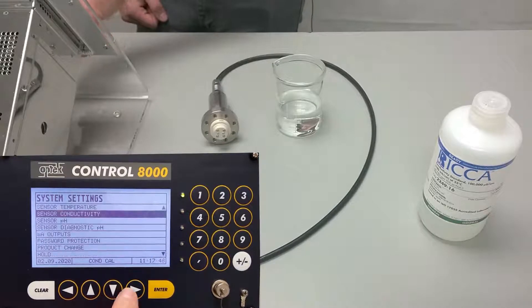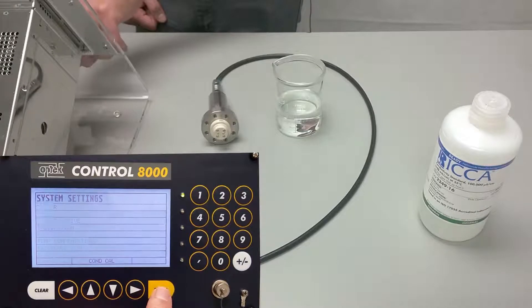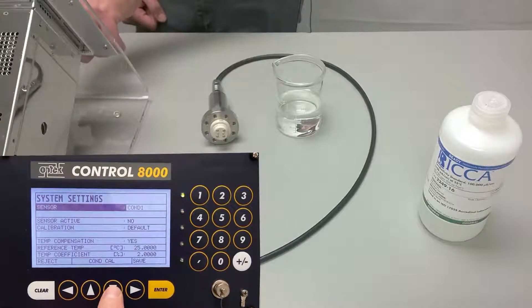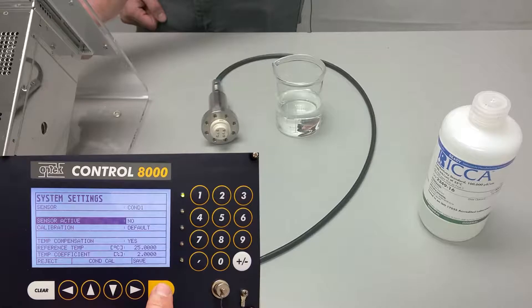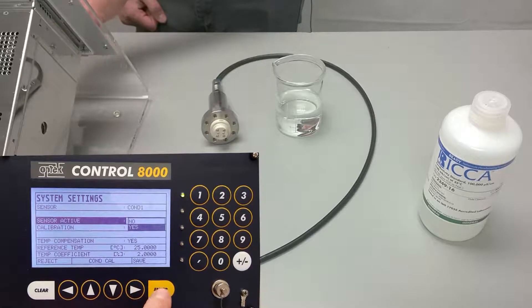Press down to get to the next menu for sensor conductivity and press enter. COND1 is selected; change sensor active from no to yes.